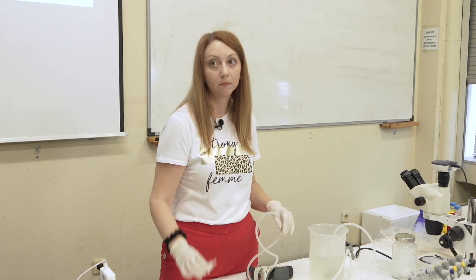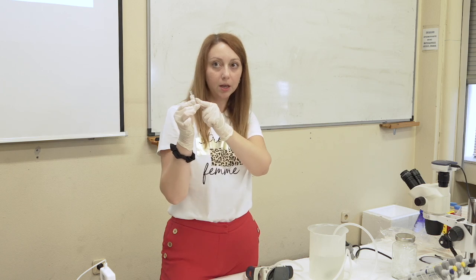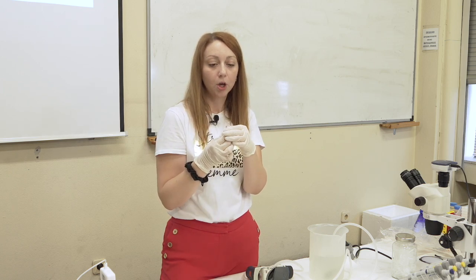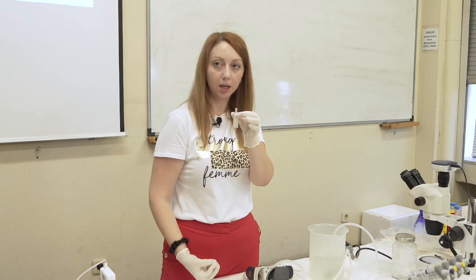So the DNA is inside the filter? Yeah. And then you break it, or how do you access it? No, I proceed with everything here, inside the filter. The DNA extraction, how do you access the filter? All the solutions come inside the filter, and then you take the DNA.